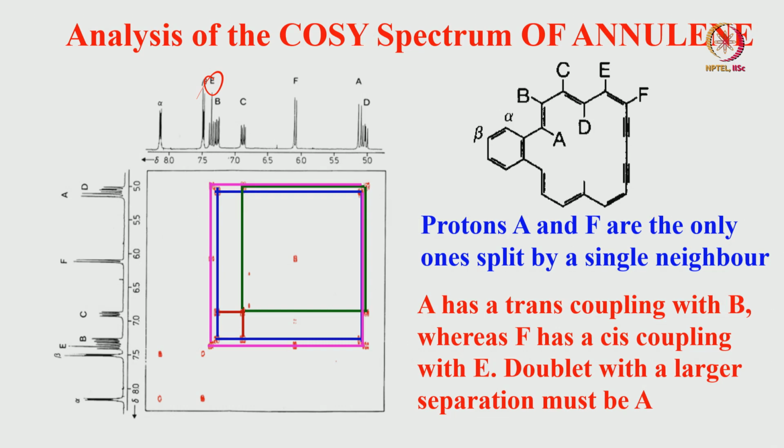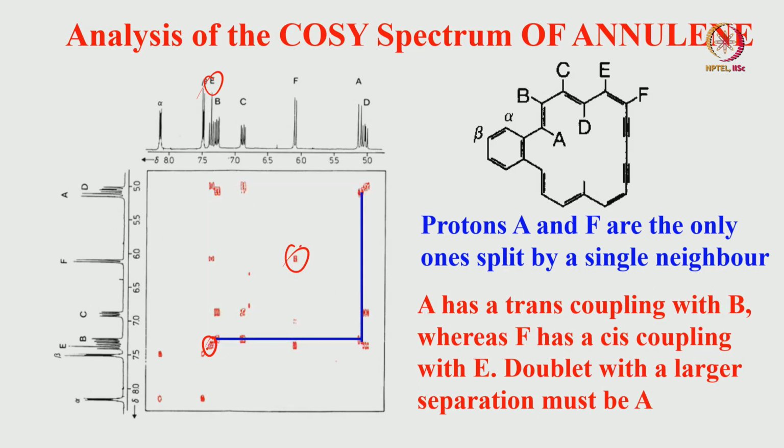Further, from E diagonal, you are going to have coupling with F like this. This is a diagonal. So A and E and F are coupled. So, very easily you can make the assignment. Start with the known one. I will repeat it quickly, you can understand now.